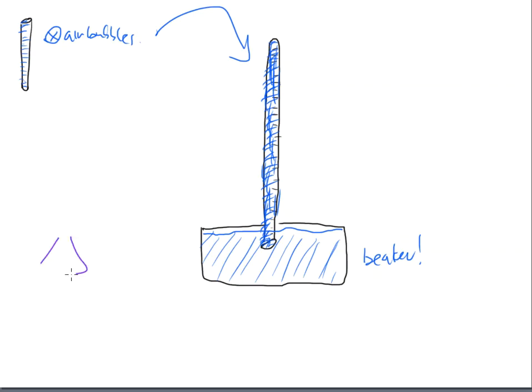oh, well, let's take some kind of flask and let's put a chunk of metal like my zinc on the inside. And this zinc and this hydrochloric acid is going to react, and products are going to get formed, and part of those products are gases. All right, so the gases are going to, up it goes. There's nowhere, it just fills the room.